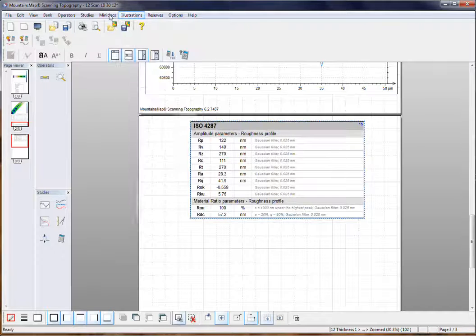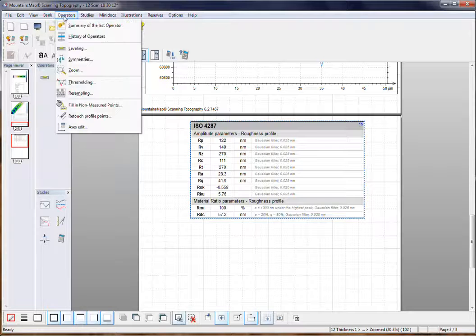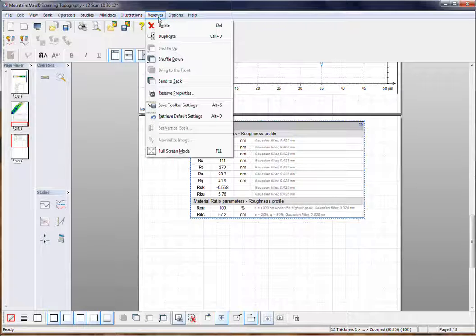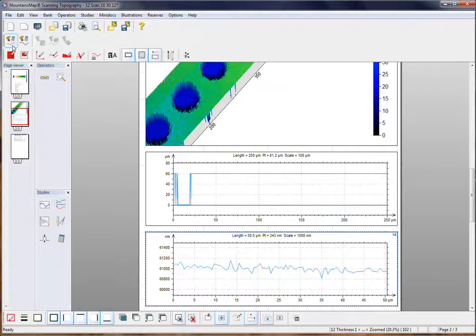It also has some very good features where we can correlate it with a contact probe. We can actually set the virtual size. Since this spot is much smaller than most probes, we can set the size of the virtual probe to match any of your surface roughness contact measurements that you're making. Anyway, just a real quick idea.